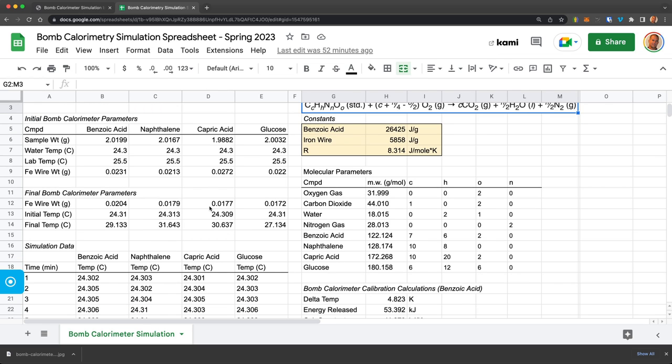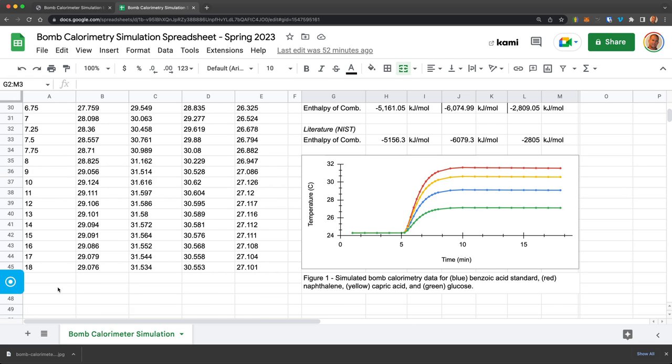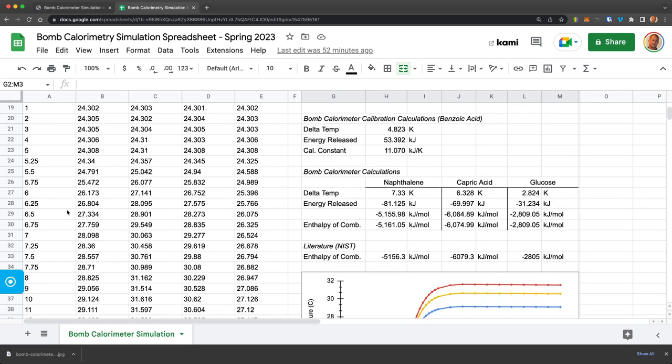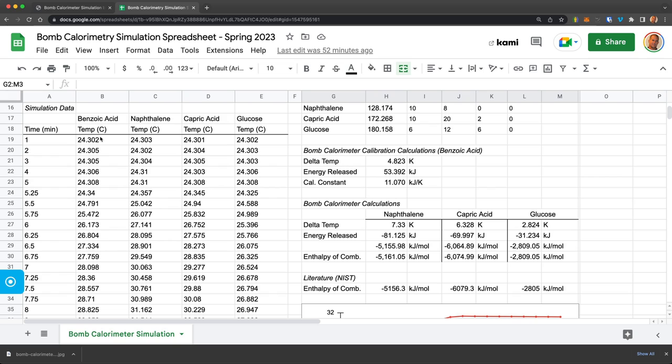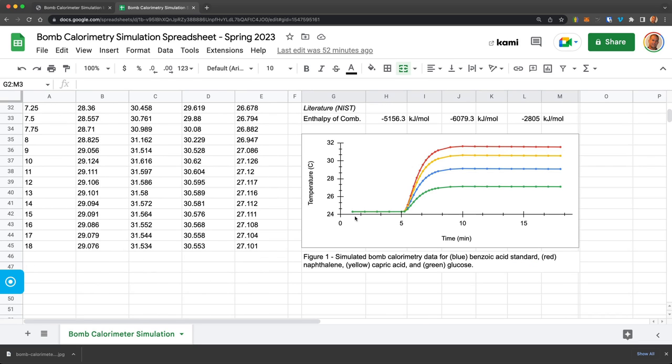And then this is the data where it always gives the same time points out to 18 minutes. And the data it gave, I pasted here into these blocks for benzoic acid, naphthalene, one fatty acid and a sugar glucose. And I plotted that here.